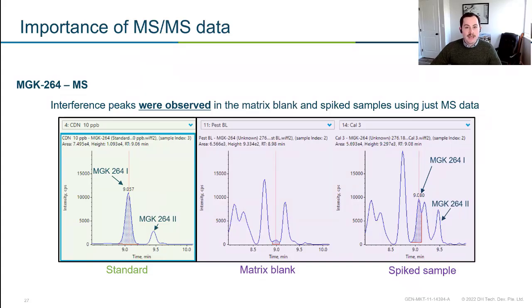So this is actually an algae protein powder. It was pretty delicious. I didn't taste it, but they were looking for pesticides in this algae protein. And they were looking specifically for MGK-264, which is a pesticide. There are 2 isomers of this pesticide. So if we look at the green box, we see those 2 beautiful isomers.